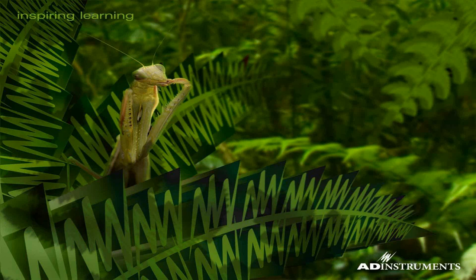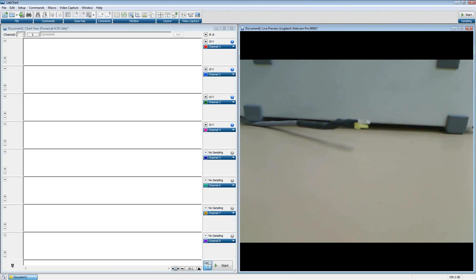So before we get going here, that's pretty much everything for my little slideshow. Let's go straight into LabChart. First thing I'm going to talk about is digital inputs and outputs. What does that mean? And the best way to explain that is actually to go to one of the hardware manuals for a PowerLab.